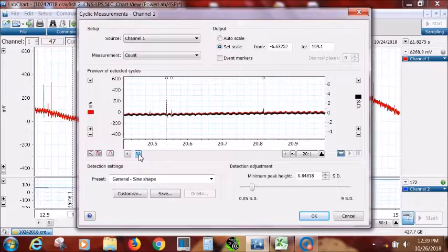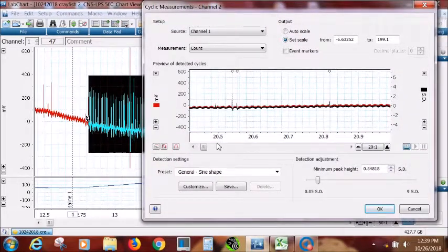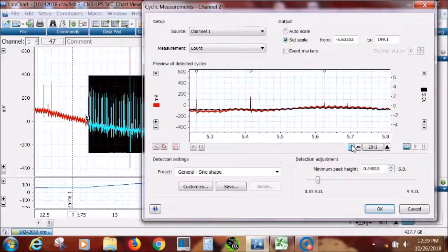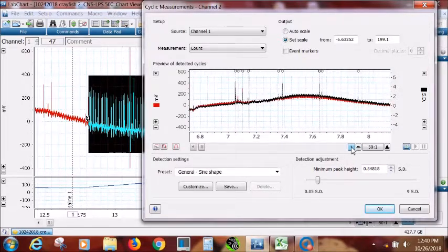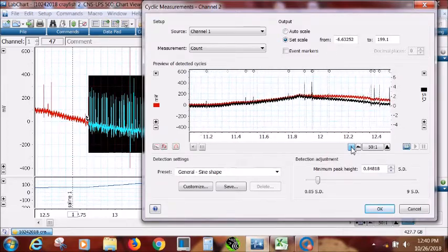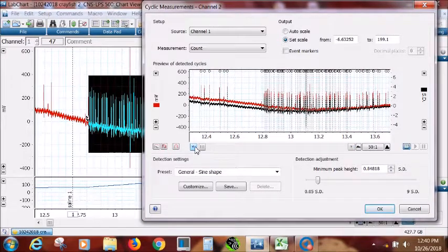Just to show you an example again, the timing in here can be a little bit off. You see that we're really at 13 and 12.5, so you can move this down to 12.5. It takes some time. If you crunch it up, it'll go faster. I'll have to make some cuts in here. Here we go. Here's the 12.5 where we started the file. And now you can kind of see what's going on there.